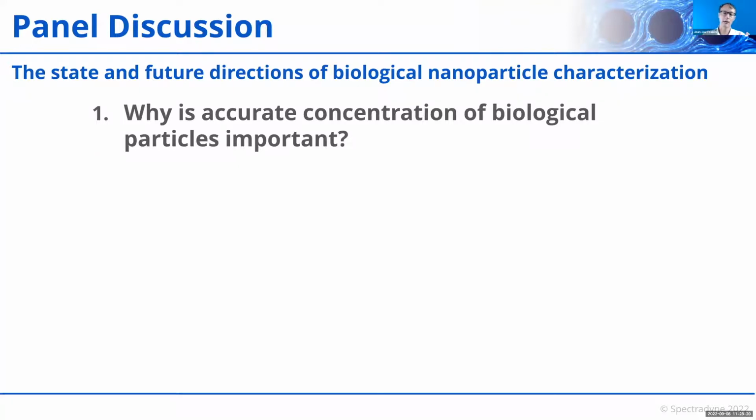And if we're talking about counting just the fluorescent particles, then it's also important to state the brightness limit of detection, right? Because that's another bound on the measurement. With this assay type, with these limits of detection, this is what we see. Right.